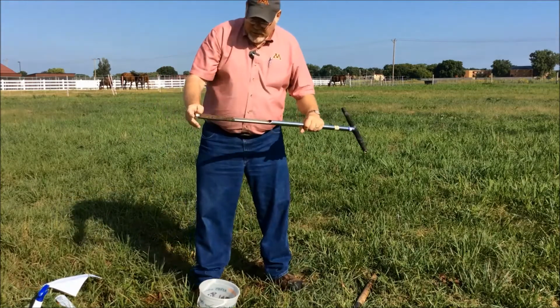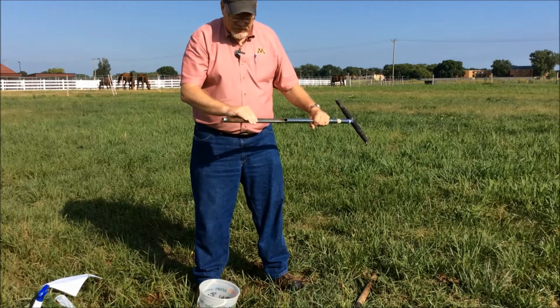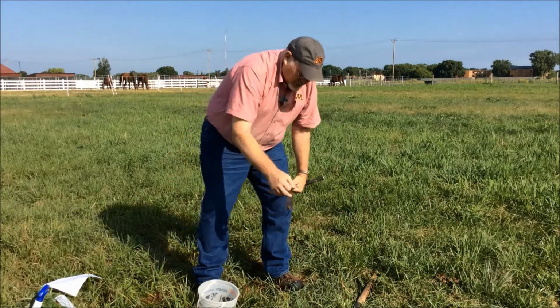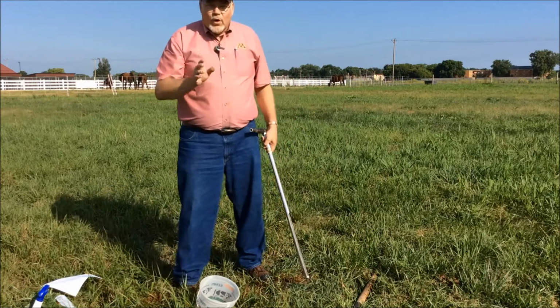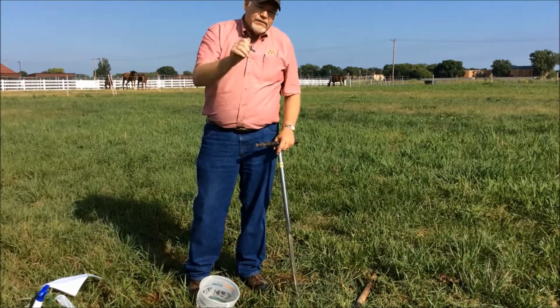So you get, this one's a little deeper than the 6 inches. So you kind of adjust it, and the core goes in the bucket. When you sample this area, you want to do a random pattern. Being from Minnesota, we'd like that to be in the shape of an M.